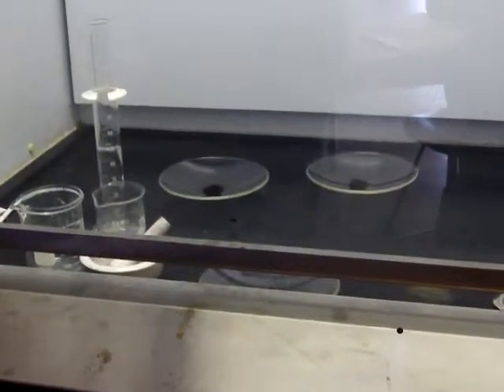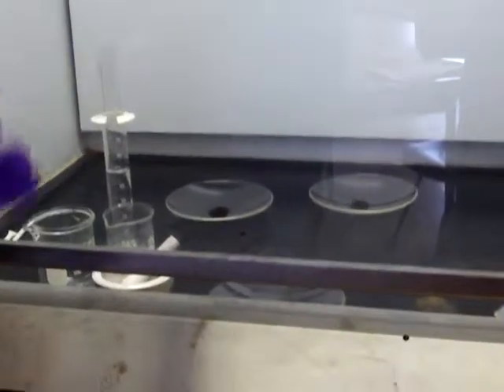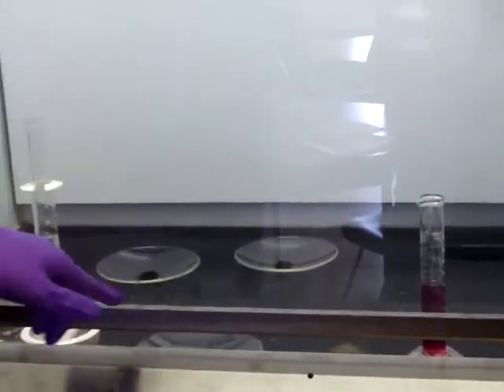Before you guys predict what's happening, this is part of the observe. After the demonstration, we'll go back and explain it all. So that's the first one. What kind of reaction just occurred? Exothermic. Okay, and I definitely recommend practicing that a few times. It took me 3 times to get that.